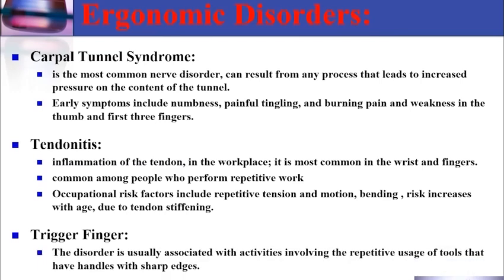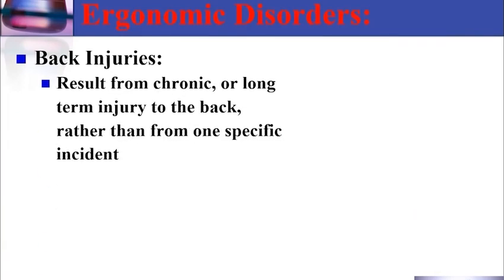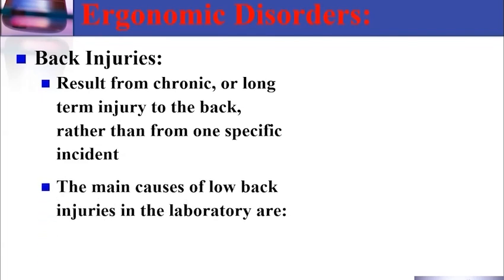Trigger finger. The disorder is usually associated with activities involving repetitive usage of tools that have handles with sharp edges. Examples: opening and closing vials, pipetting, and cover slip application. Back injuries result from chronic or long-term injury to the back rather than from one specific incident.